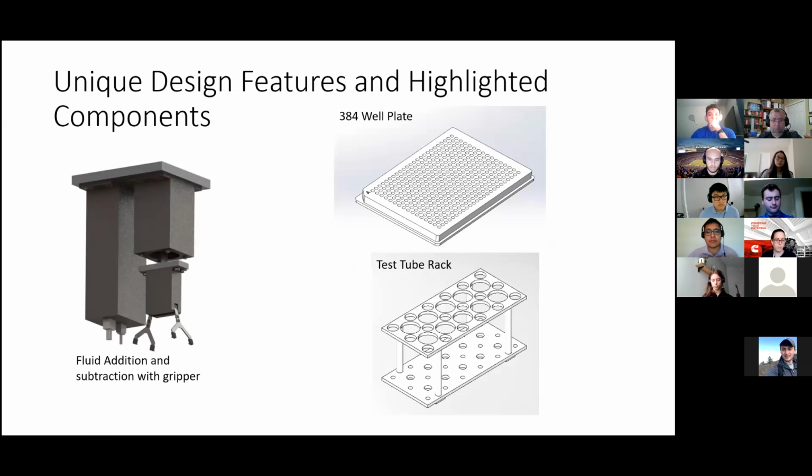All right. When conducting preliminary research, we found that none of the existing bioreactor designs have all of the features required by the US Biofoundry. Some had a few customer needs listed, such as the Clavin Lab design that can add liquid, but it does not have the ability to subtract liquid. There were also other designs that did not feature fluorescence detection for fluorescent intensity monitoring, which is essential for the customer to be able to carry out the desired lab experiments.